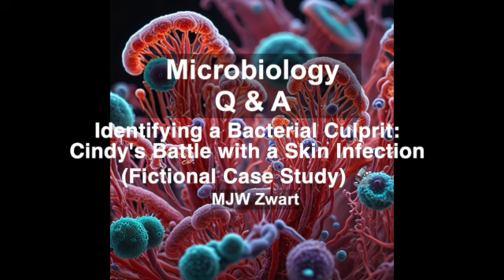Exactly. And using this technique, the lab technician was able to observe a key characteristic of the bacteria in Cindy's sample. What did they see? The bacteria were spherical and clustered together in formations that resemble bunches of grapes. Okay, that's a visual I won't soon forget. But why is that shape and grouping pattern so important? Different types of bacteria have their own signature shape and grouping preferences. Some are rod-shaped, some are spiral-shaped, and as for grouping, some prefer to fly solo, while others, like the ones in Cindy's sample, form these characteristic clusters. This information acts like puzzle pieces, helping us to narrow down the possibilities. So it's like a bacterial lineup where we can eliminate suspects based on their appearance.